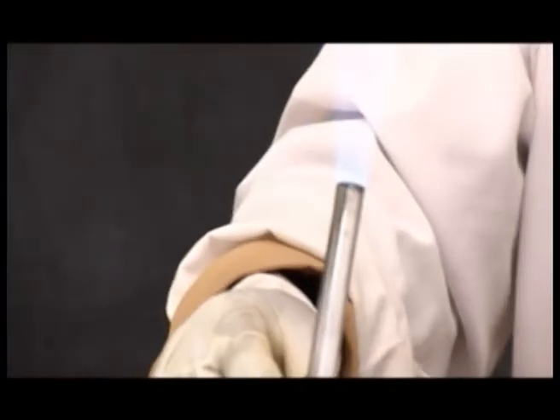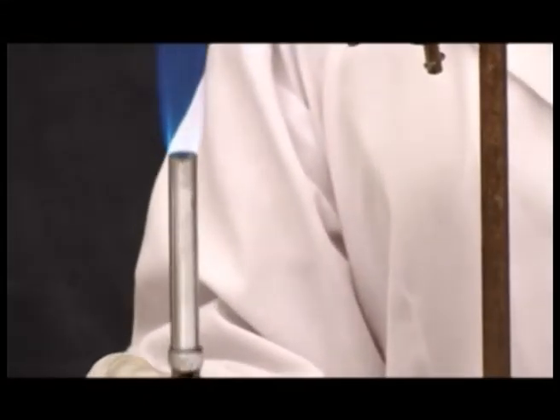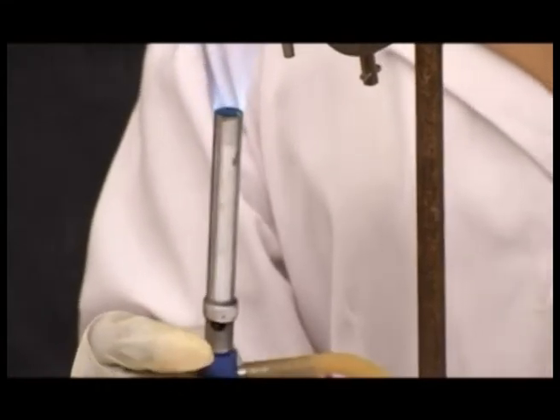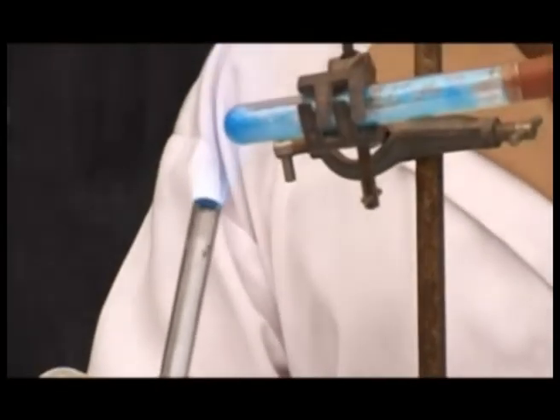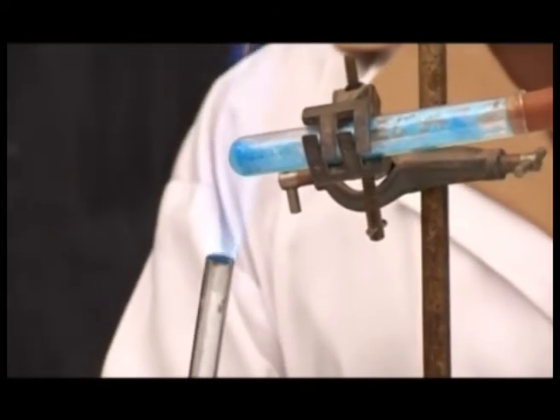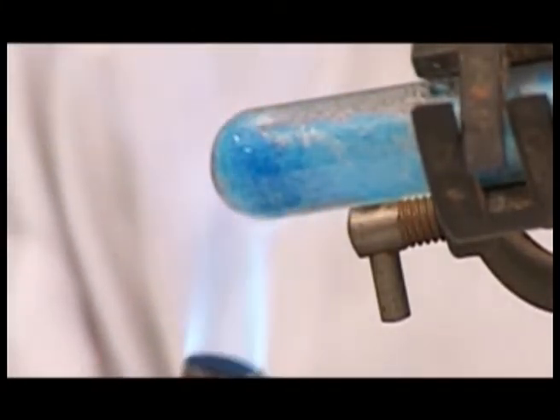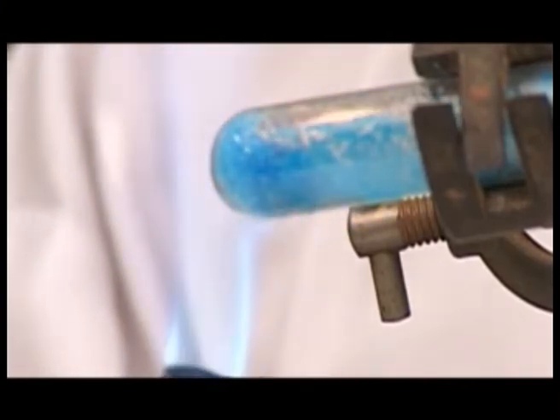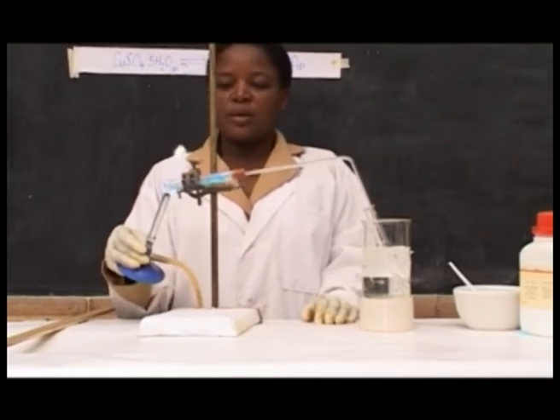Then introduce the heat source to the salt, that is copper sulfate. Heat the salt gently and observe the changes. The color of this salt is blue, so just observe what will happen. In the test tube there is water vapor which is coming out.